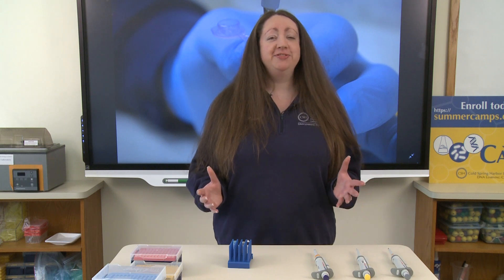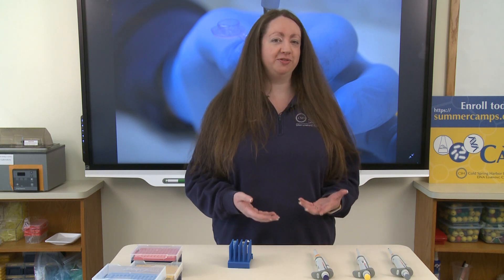Today we're going to talk about micropipetting. Micropipetting is a very useful tool for when you want to measure and transfer very specific, and in this case very small, volumes of liquid.